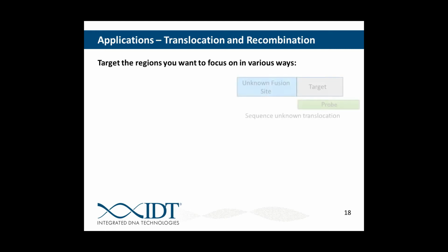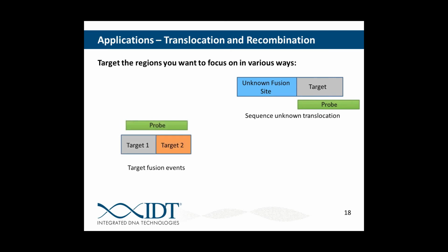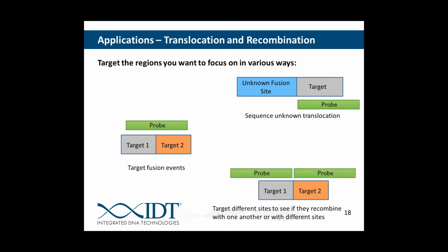So there's three ways to approach this. There's a way that's just like the integration site approach, or the transposon site approach, where it integrates and you're just sequencing the unknown fusion site. But what you can also do is look for these fusions if you are trying to detect them because you know that they exist within your sample, or using it for a diagnostics approach where that specific fusion event is related to a phenotype. So you can design the probe so that it spans the junction, and you can capture that junction anytime it occurs within your samples. And lastly, if you're doing something like VDJ recombination and you want to know whether a large group of fragments may fuse together, you can have probes that are designed for any of these fragments, and by pulling them down with both probes, you'll identify that fusion junction.